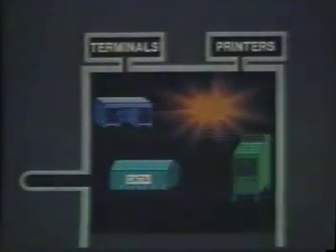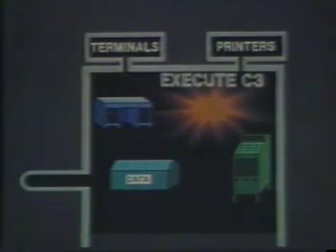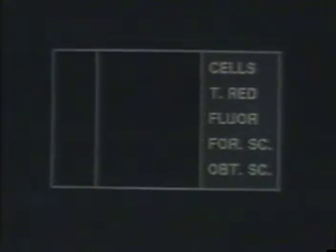To indicate that he's ready to collect data for a sample, Tom uses a one-key command called execute. Like the insert command that Tom used earlier, execute is a multi-use command that the Secretary interprets somewhat differently depending on the kind of desk drawer being used. Since Tom is using his collection drawer, when he gives the command to execute C3, the Magic Secretary will show him the collection label for that sample.